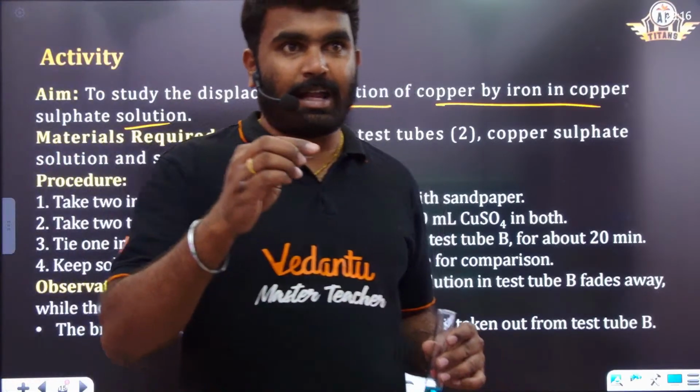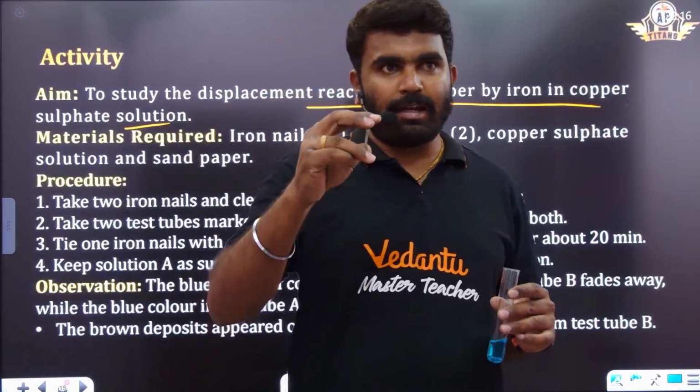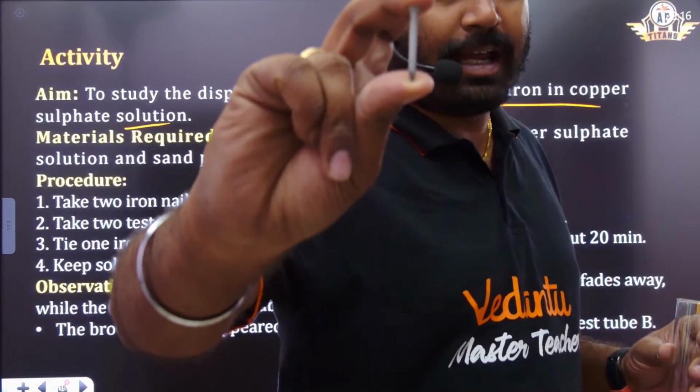Okay, this is the iron nail, right? So this is the iron nail I have.